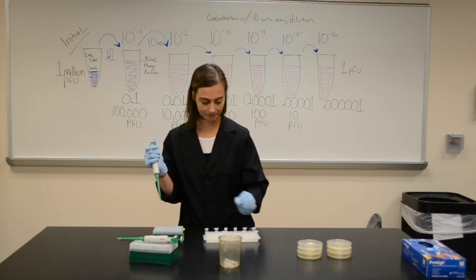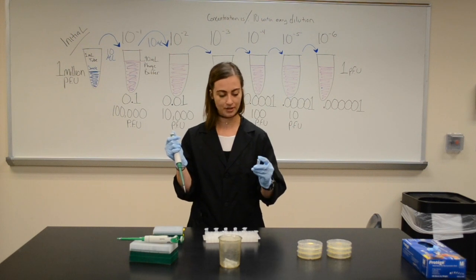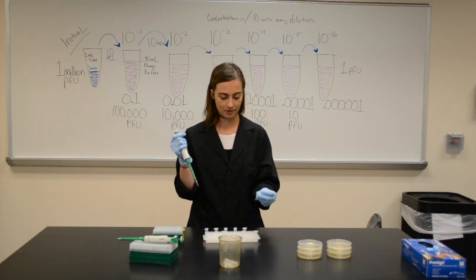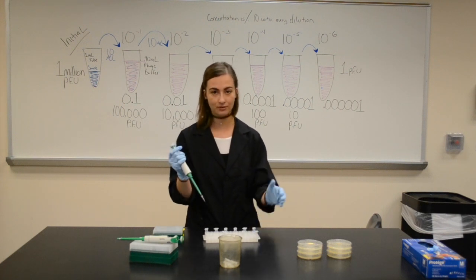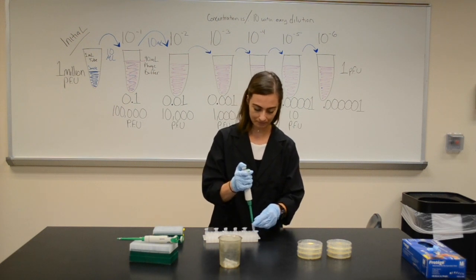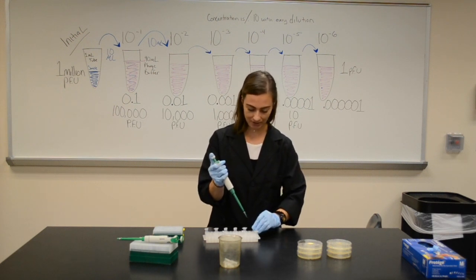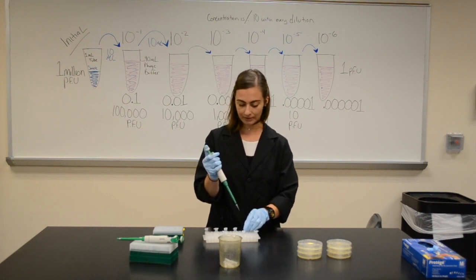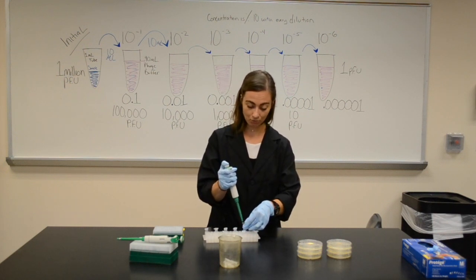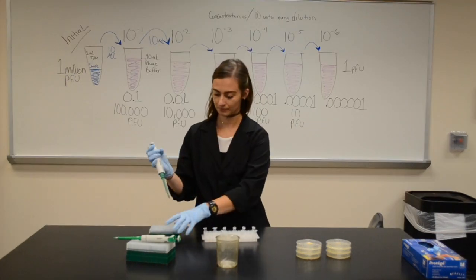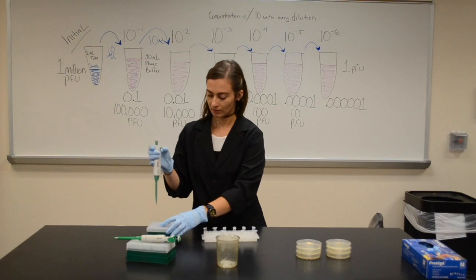I'm going to take my tube that I just put 10 microliters into of my sample, that has 90 microliters of phage buffer in it already, and give it a little shake because I want to get everything dispersed. And I'm going to take 10 microliters of this from 10 to the minus 1 and move it into the next tube.